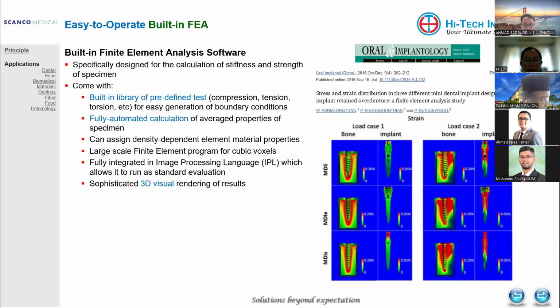It's just that for this one, the ScanCo itself does have its own built-in finite element software. So if you have the built-in one, it means less hassle, as you don't have to export out the relevant format. But of course, it is still compatible with other types of finite element software, just that you have to export out the format which can be imported into the software, acceptable by the other software.